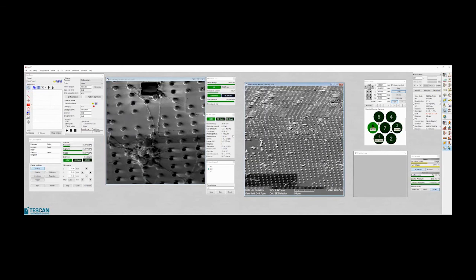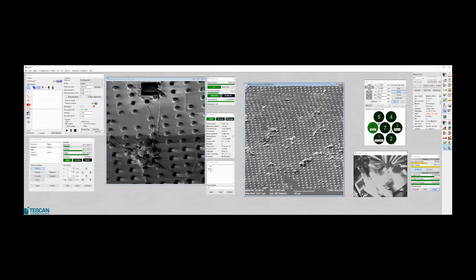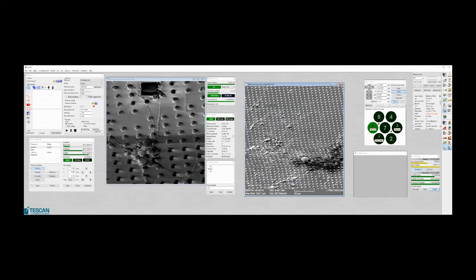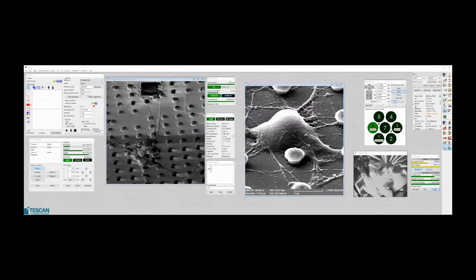So you can run, I don't know, I have to find a nice one. Oh, there is a big one, not that one. So for example, this one. Yep, nice one.